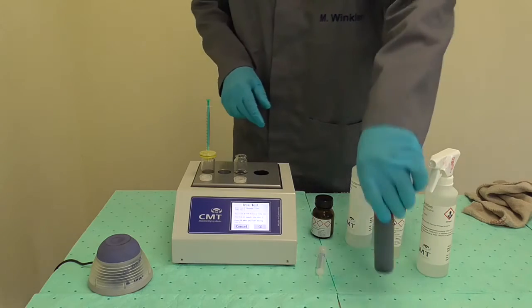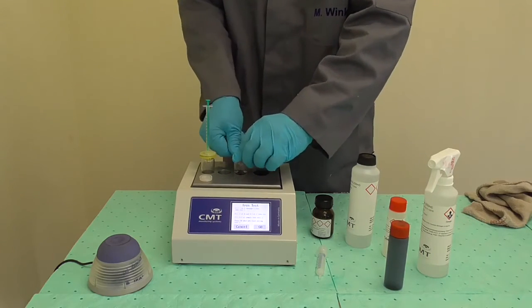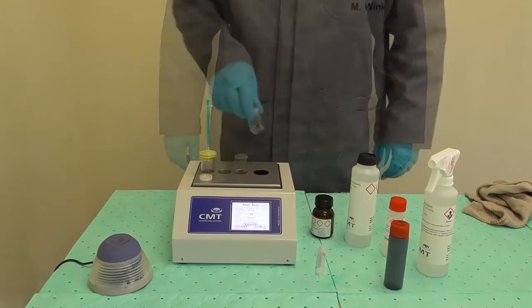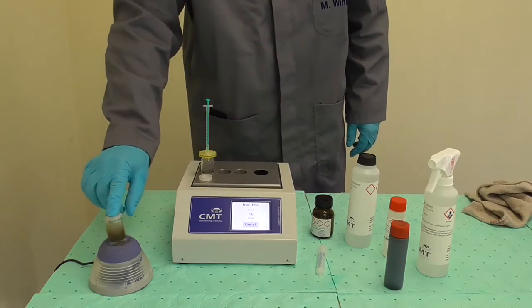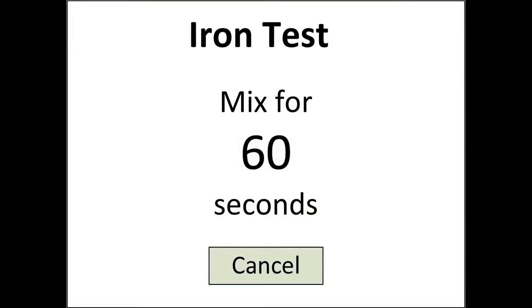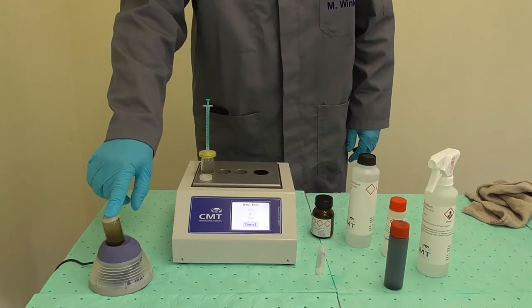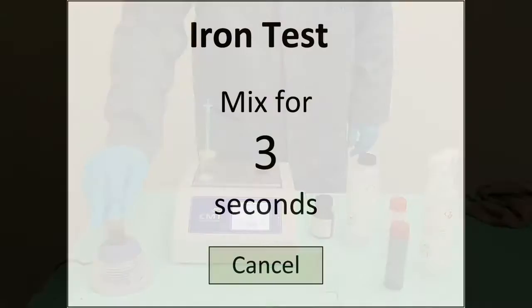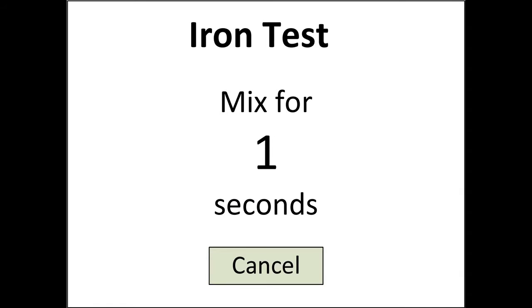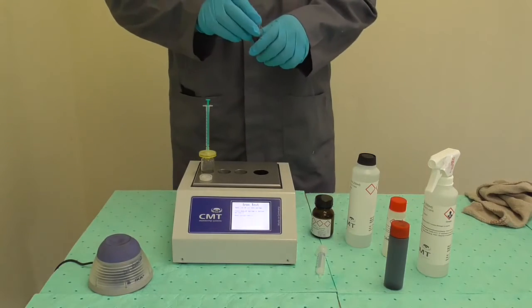Cap the vial and shake it using the electric shaker for exactly one minute. Press go on the device to start the one minute counter. For best results, use your index finger to apply a constant pressure on the vial — do not press too softly.